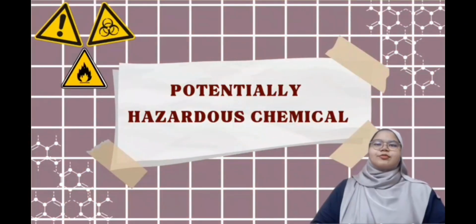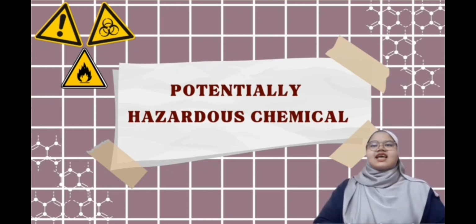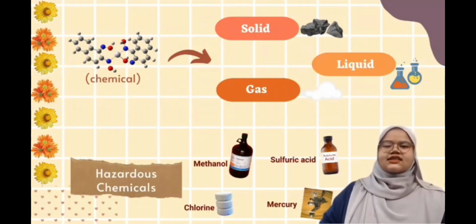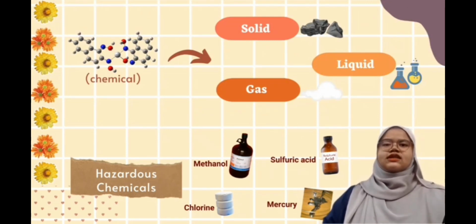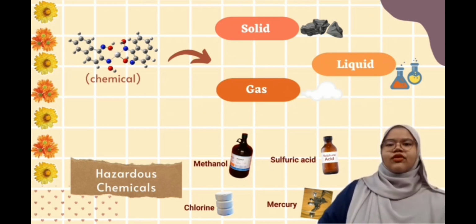Hi everyone, I am Nurfatin Afrika. I will present the subtopic of potentially hazardous chemicals. Let's go. A variety of hazardous chemicals are commonly found in the laboratory. Hazardous chemicals are substances that can cause adverse health effects, as explained by Alisa before.